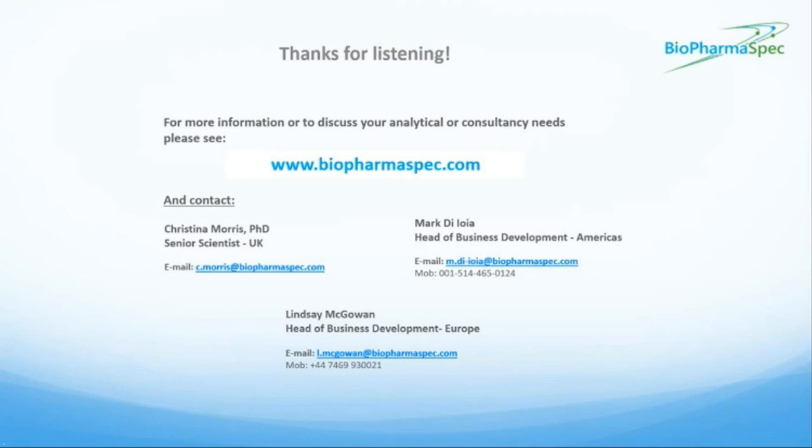And so the clearance that you're looking at in those bar charts is just an example from a client study where, as we moved downstream through the analysis process, we saw fewer and fewer HCPs. So that's what we've shown there. We've shown different sample types on the X, and on the Y we've got the amounts that have been quantified based on the SWATH data that was analyzed and reviewed.